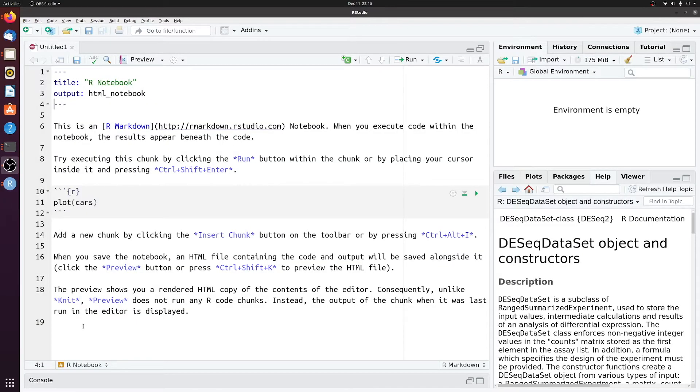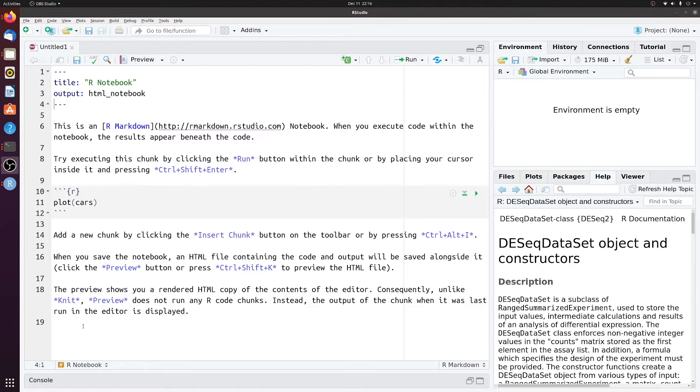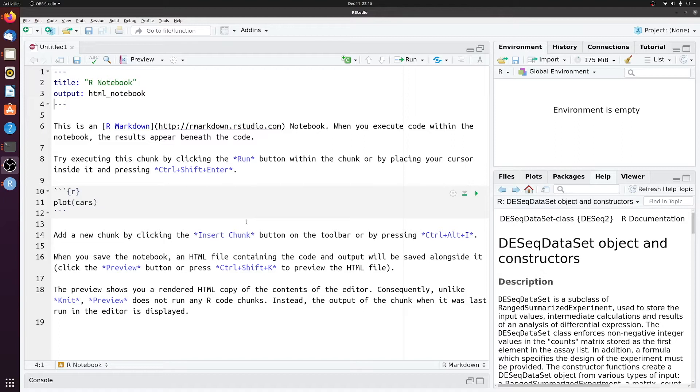So we're going to be using DESeq2 for the differential expression analysis. And DESeq2 was written in R, so we have to run in R. So if you don't have R already, install R, and then I find using RStudio is much nicer. You can save everything and keep track of what you've done. So install R and then RStudio. And then when you create a notebook, you'll have something that looks like this.